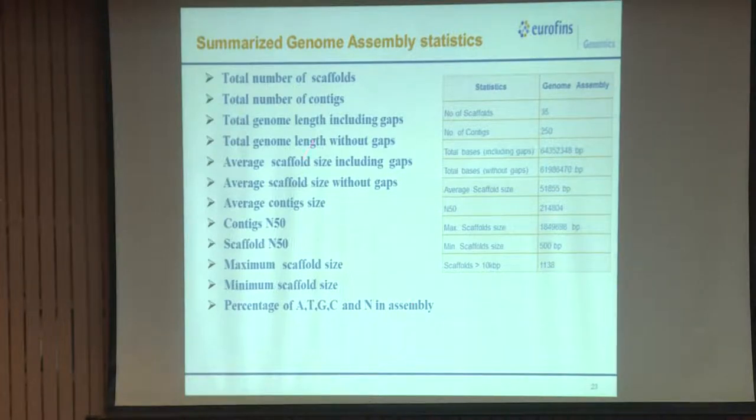So once we are approaching that size with gaps, we see without gaps how much. So from here we can see how better is my assembly. If I am ending up having 50 MB and only 4 MB is my bases and rest is all Ns, that means a huge difference. So that cannot be an assembly, that cannot be a draft assembly. It should be the opposite way. It should be somewhere around 45 MB and 5 MB I am having gaps, or 10 MB I am having gaps. That's a comfortable genome assembly to be published, right. So this is what we see.